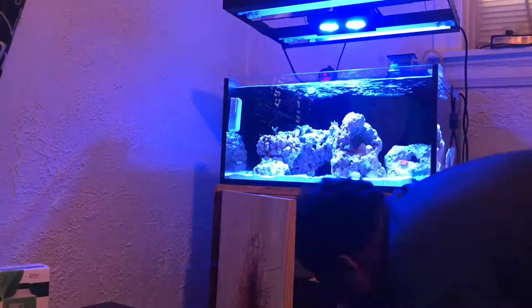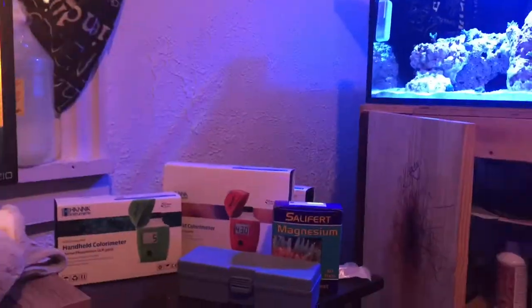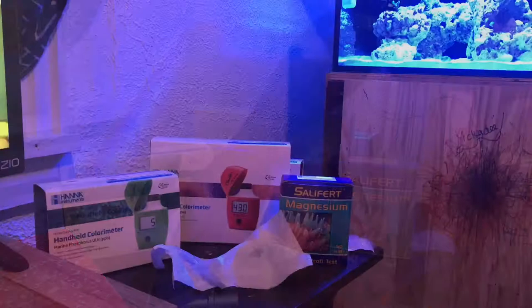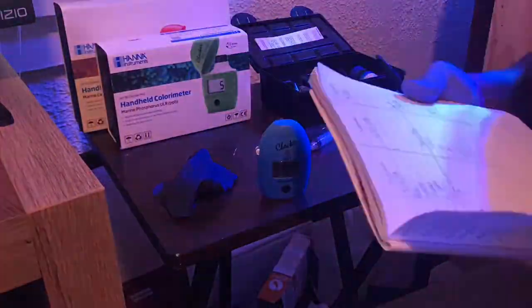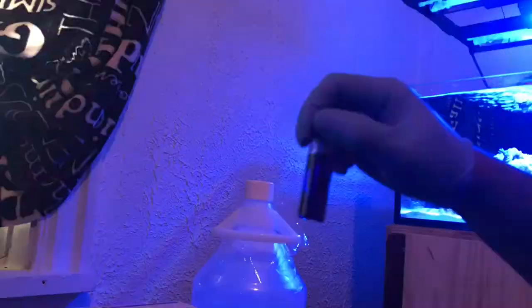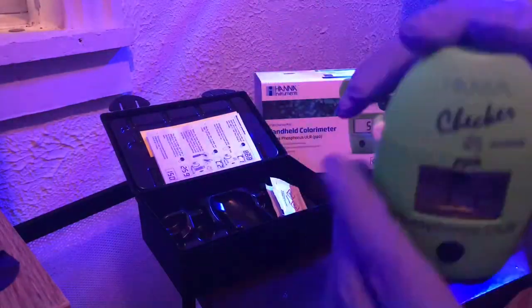Here's the voiceover — I'm basically showing you the equipment I'm using: the HANA Checkers, the whole collection, the refractometer, the magnesium. I'll get very good accurate readings from this. Nothing's perfect, but this gives me accurate enough readings to keep what I think is stable and ideal for where my parameters are at. I'm just going to be going over a quick run-through of my charting and the equipment I'm using to test. Knowing is half the battle — knowing when to intervene with your tank and knowing when to stay out of your tank is very important because you don't want to overdo anything. Again, if you don't test it, you don't dose it. I am looking for my parameters' fluctuation, and I'm looking for when my parameters are stable.